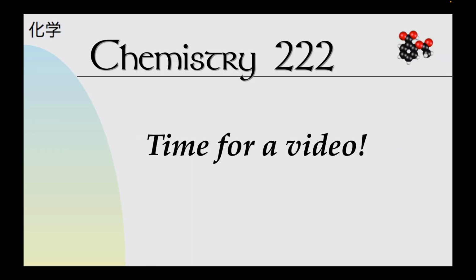It's not a problem. Okay, at this point, I think it's time to watch a video to see how the lab is going to work when we actually get into the lab. This is kind of a fun lab. Definitely wear your goggles when you're dealing with a lot of these chemicals, especially the hydrochloric acid. It's pretty strong. Check this video out, and if you have any questions, let me know. Good luck on your lab.